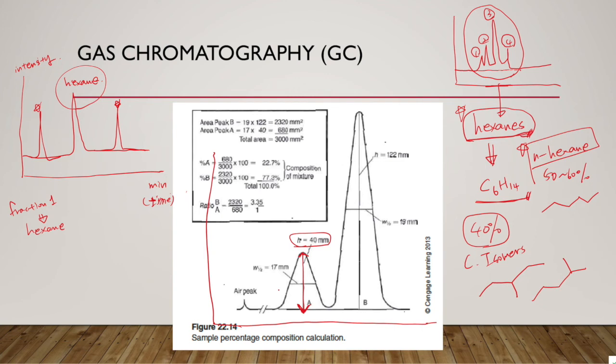That means there will be 2 chromatograms provided in Canvas in PDF file form, you should just print them out. Okay, so print them out and use your ruler and physically measure in millimeters the height of the peak, and also measure the width of the peak at the half height, in millimeters too.